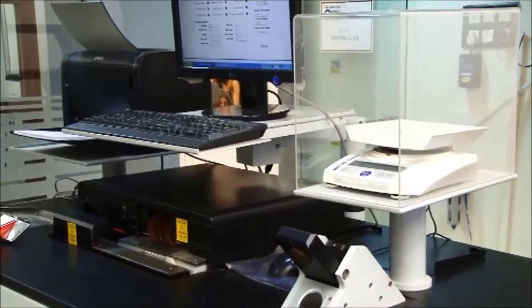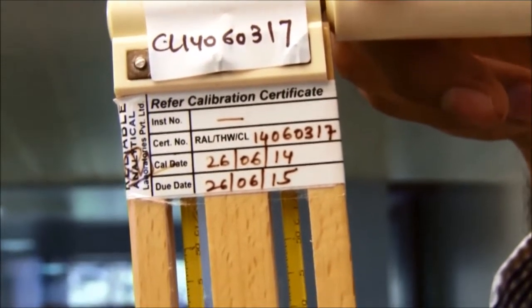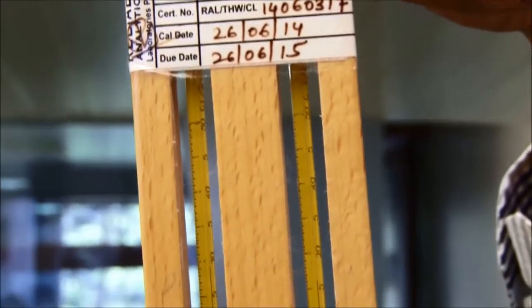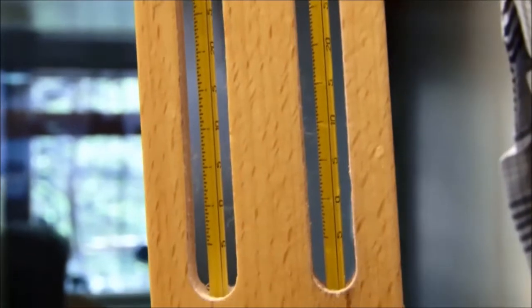Standard conditioning of cotton before testing. Reliable reports, guaranteed confidentiality, and reasonable testing charges. Expert staff with more than 34 years of experience in cotton testing.